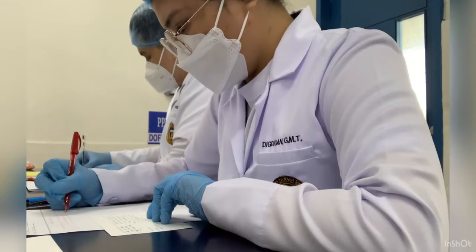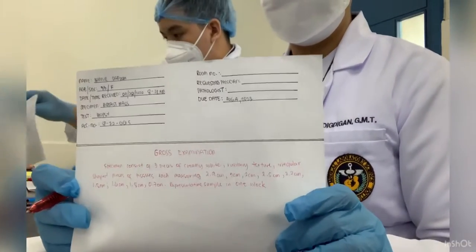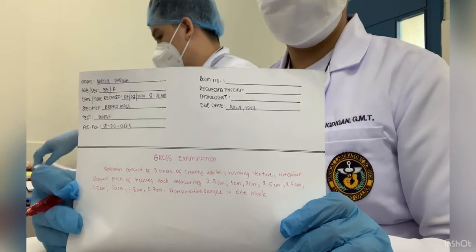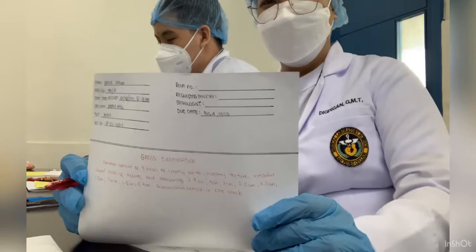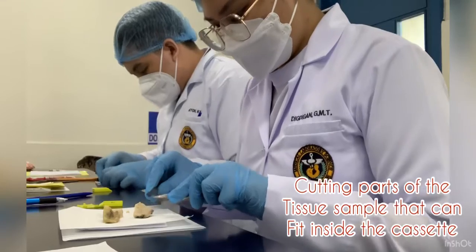For the second specimen, it has 2.5 cm, 2.2 cm, and 1.5 cm. And the last specimen has 1.6 cm, 1.8 cm, 0.7 cm. Representative sample in one block.